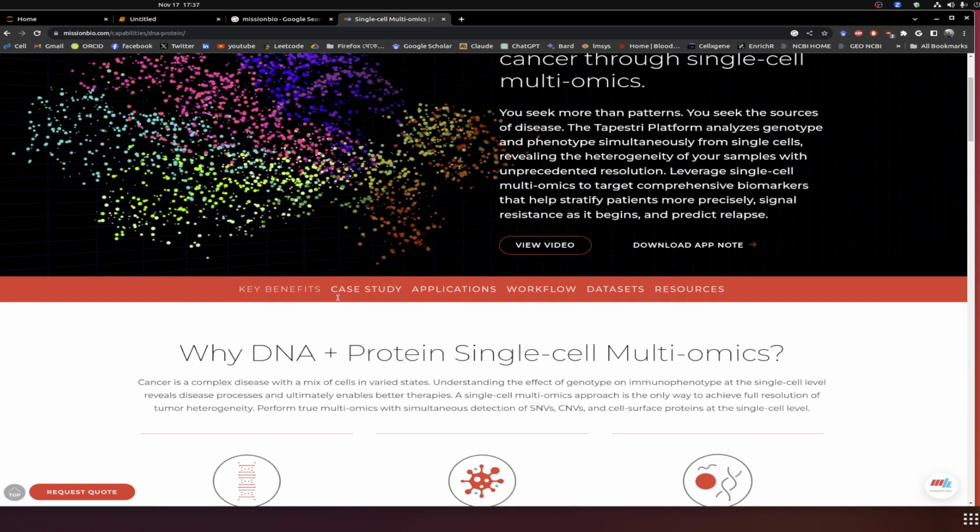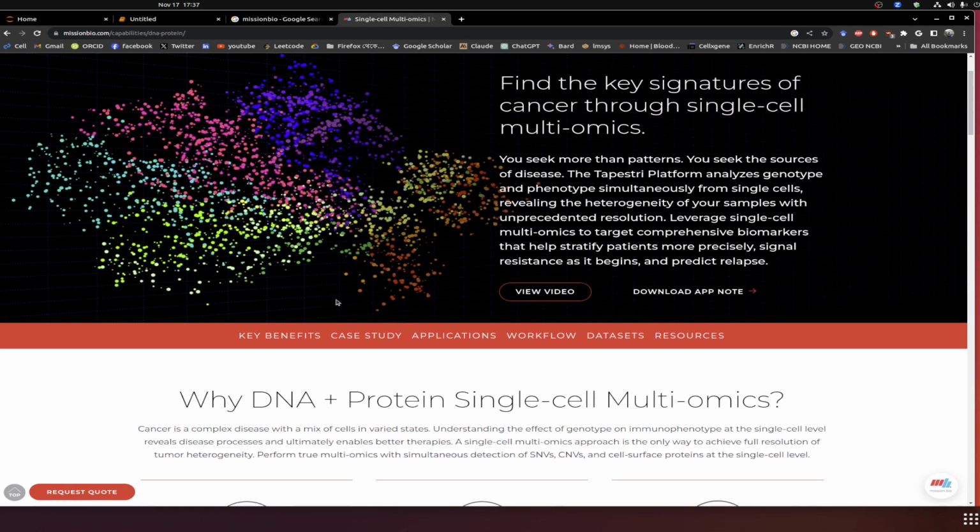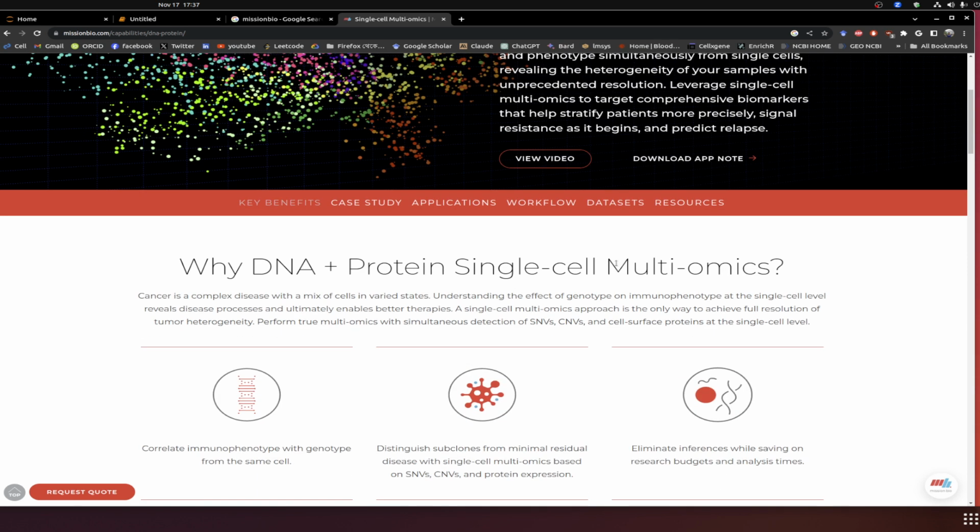So in this series of tutorials, I will go through, step by step, the bioinformatics pipeline development, optimization, and functional analysis, based on our biological interest, to analyze this DNA plus protein single cell multi-omics data.